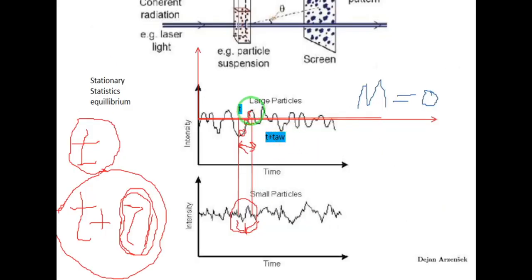As we showed here, within this signal, at the time t here, when we increase the time delay and for example come here, we cannot predict the values of these light intensity based on the value that we have here.